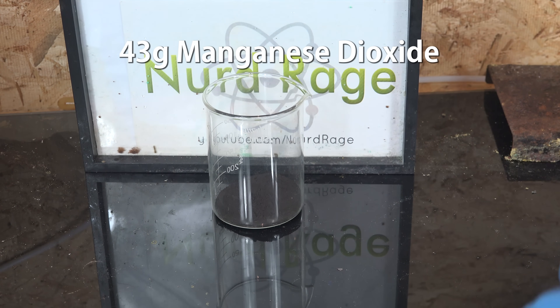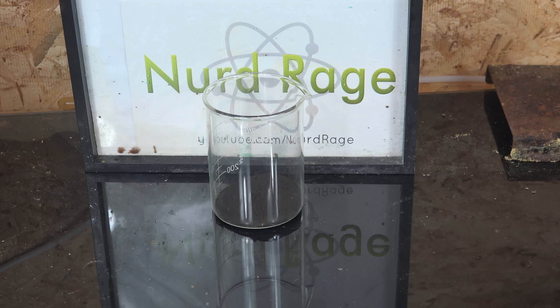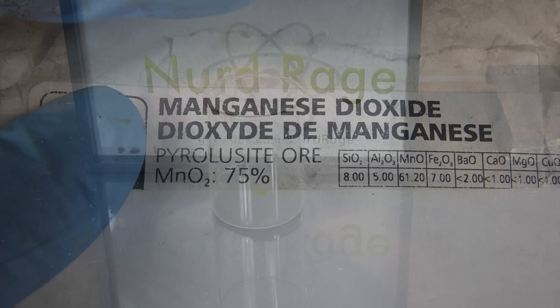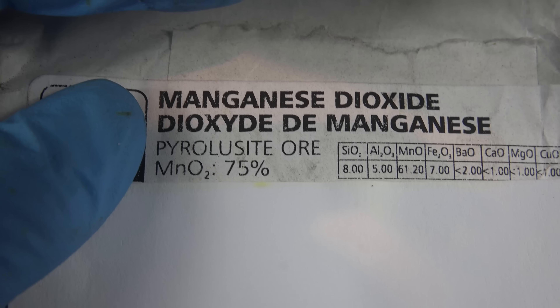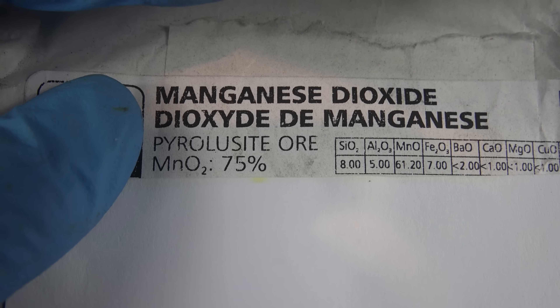We first weigh out 43g of manganese dioxide, available as filter media for green sand filters. I'm using pottery-grade manganese dioxide, which admittedly is not very good, but it works. My particular brand claims it's 75% pure, with the rest being sand and iron oxide.